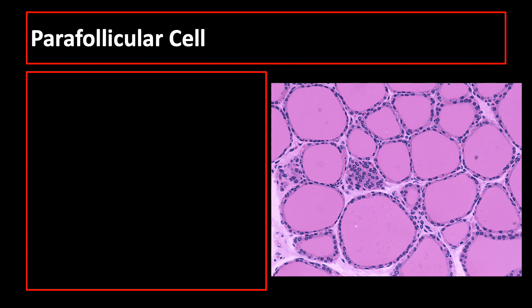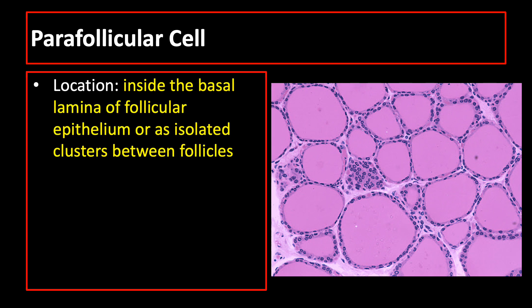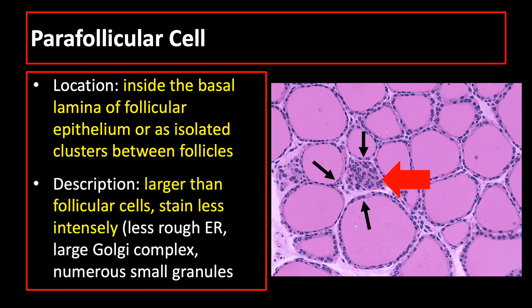Parafollicular cells are found inside the basal lamina of follicular epithelium or as isolated clusters between follicles. In the image, these are the follicles and in between are the parafollicular cells. Parafollicular cells are larger than follicular cells and stain less intensely.